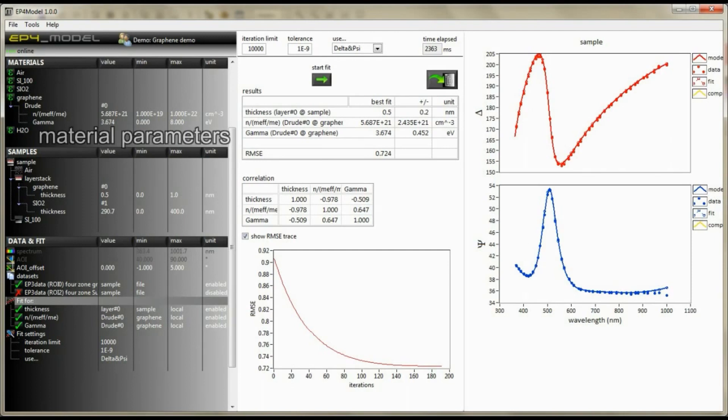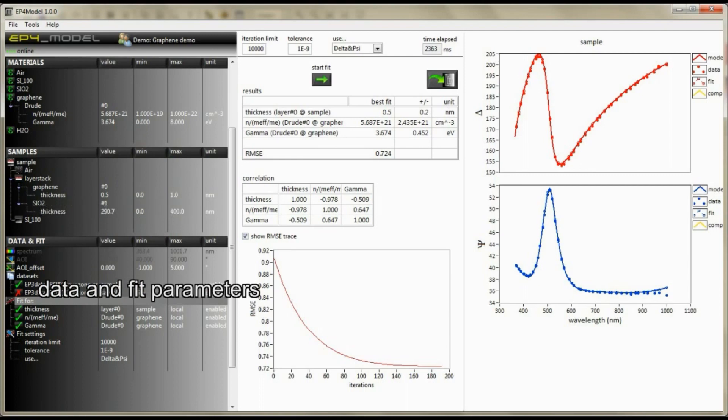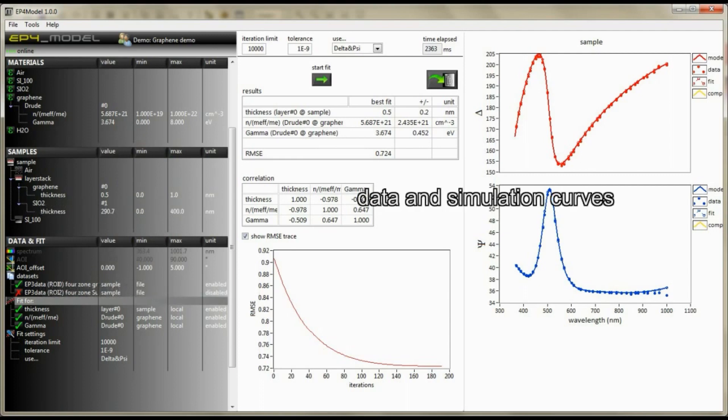The all-in-one window view allows you to have access to all material parameters as well as to the data, fit, and simulation curves.